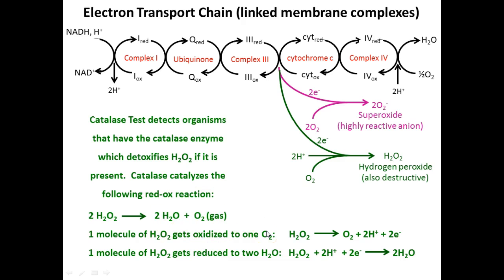This is why you see what? Bubbles, right? Because the oxygen is in gas form. Those bubbles contain oxygen gas. Yeah, this top one, this complete equation.